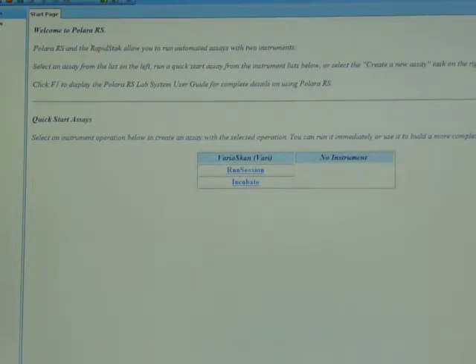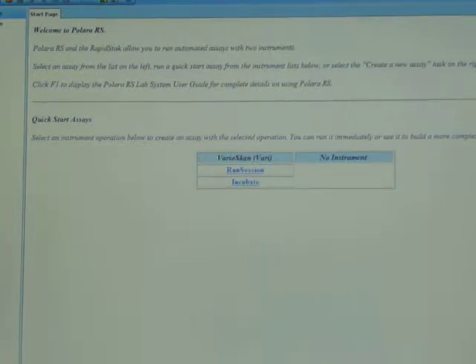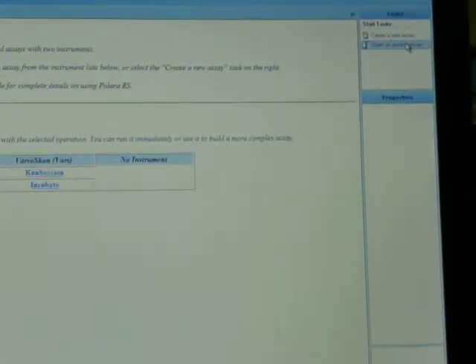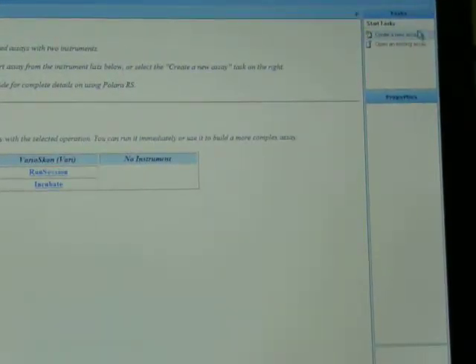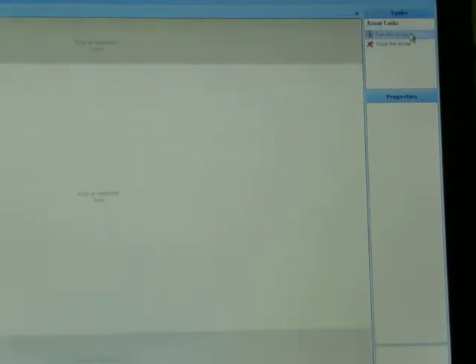To start a protocol, I'm going to pan over so you can see the top right corner, and I'm just going to click on create new assay.